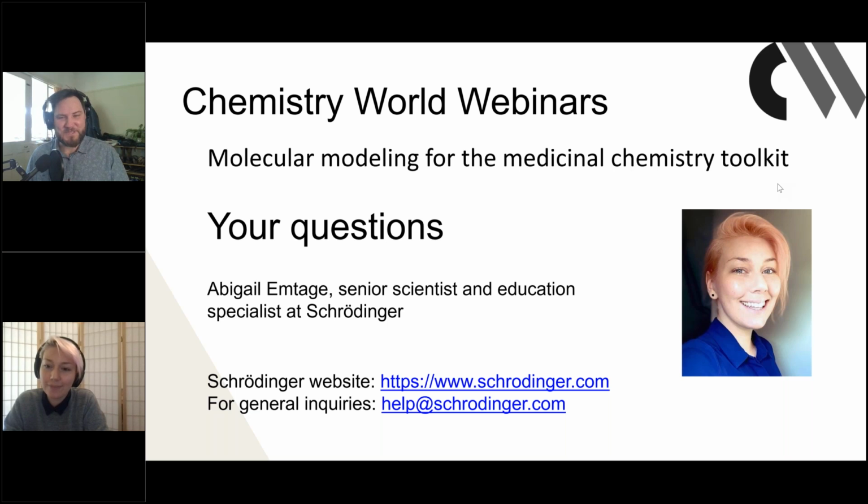Okay, well, talking of more specific things to get into, Cezanne has asked, is it possible to add additional info while designing the molecules like blood-brain barrier permeability, GI absorption, etc.? Yeah, that's again a really great question. So a couple of features within LiveDesign, you have the option to add your own free-form columns.